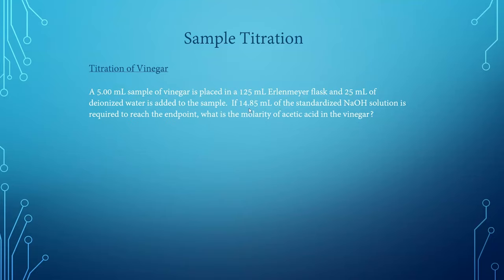Once again, we'll carry out the titration. This time, it took 14.85 milliliters of our sodium hydroxide solution to reach the endpoint. And from that, we can calculate the molarity of the acetic acid.